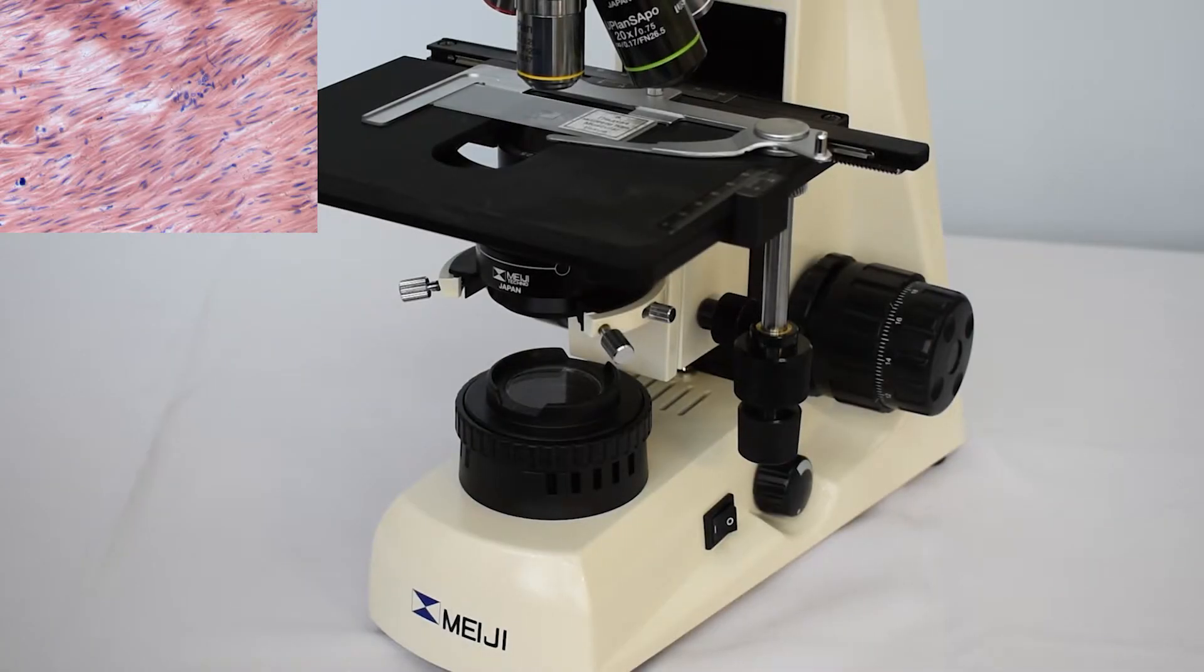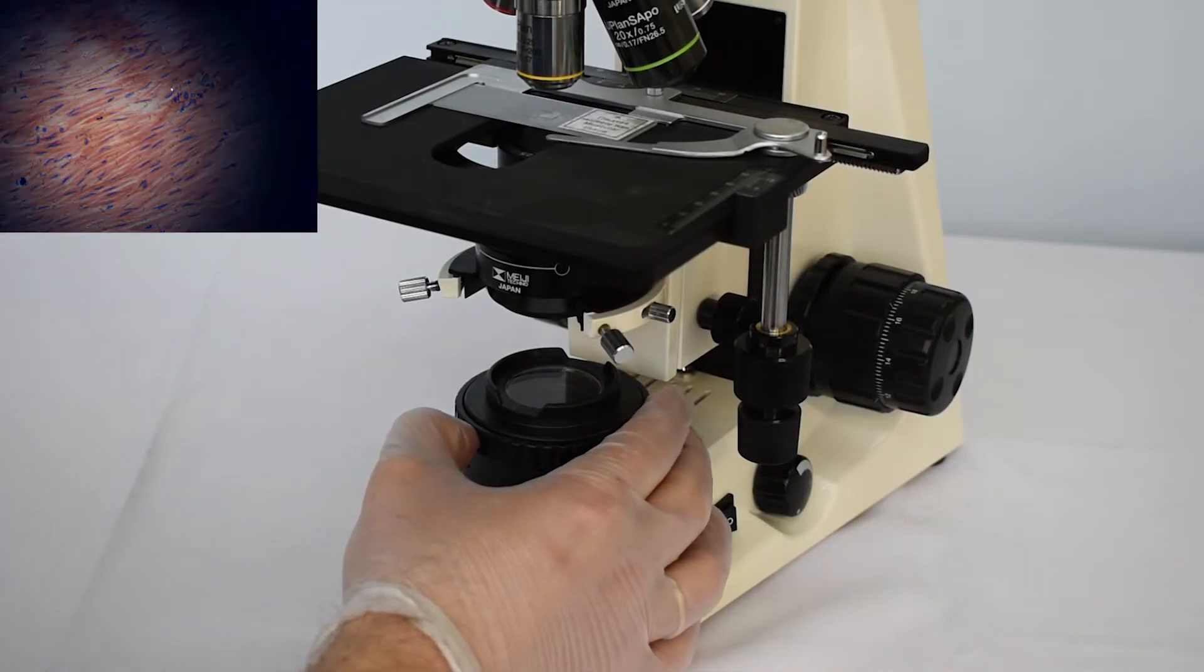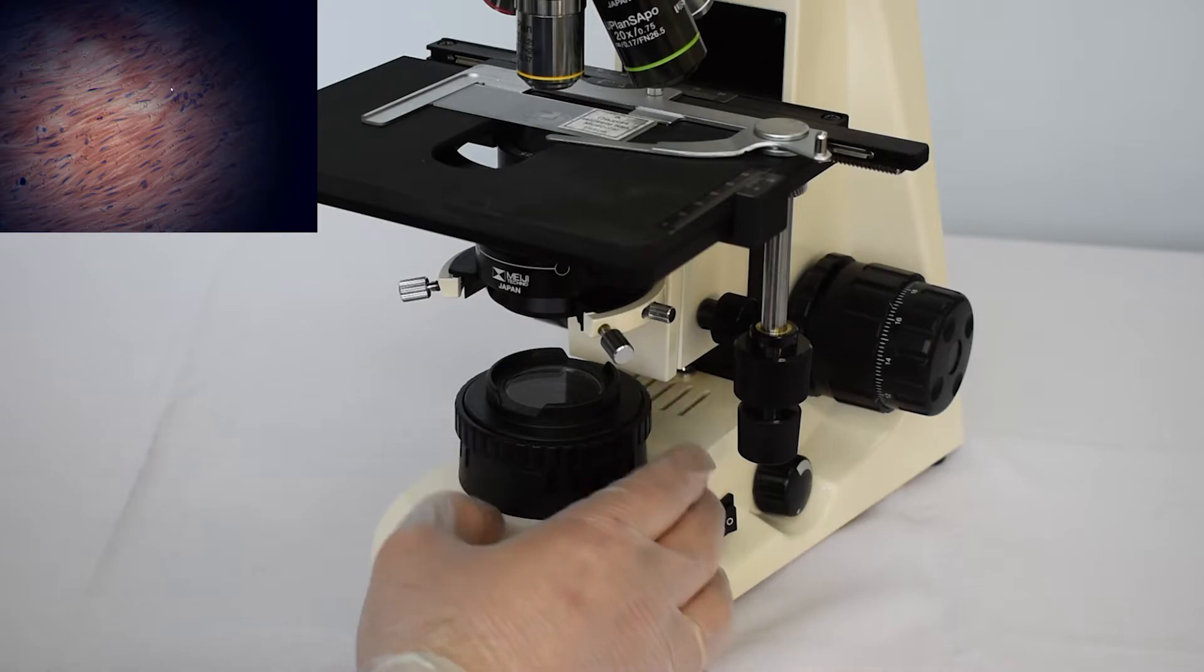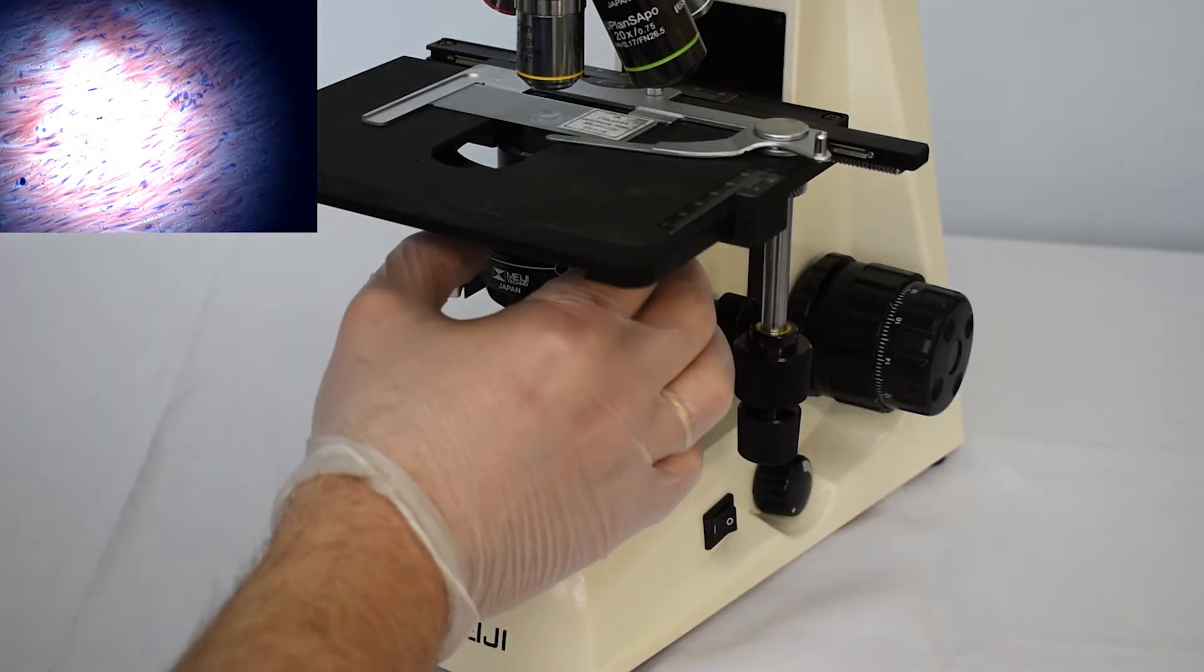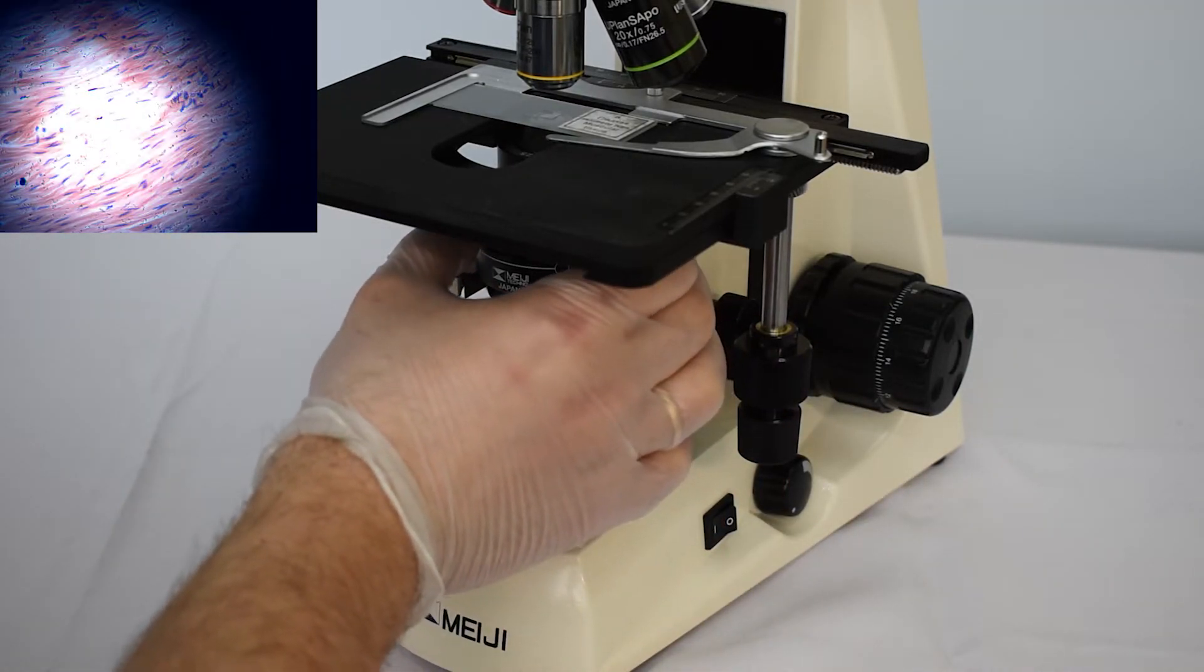Next, close the field diaphragm of the collector lens, increase the light intensity, and close aperture diaphragm of the condenser.